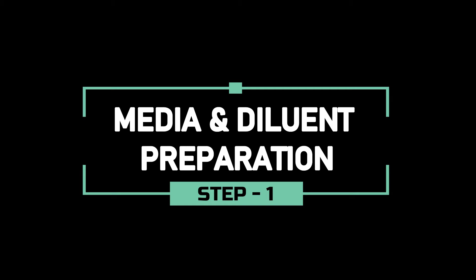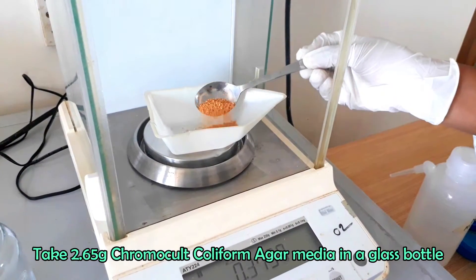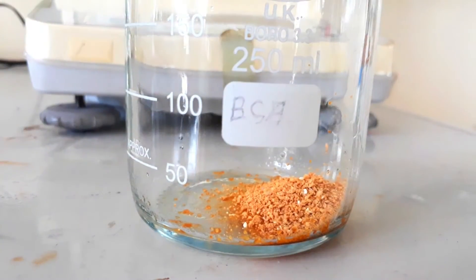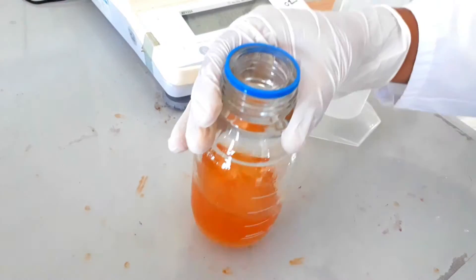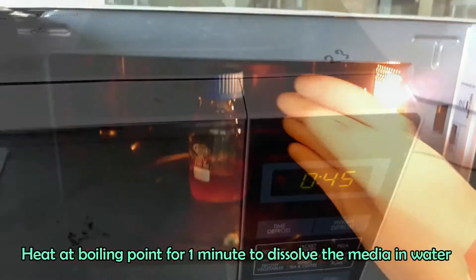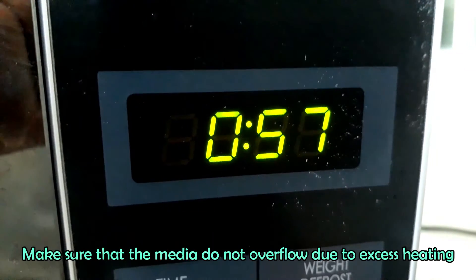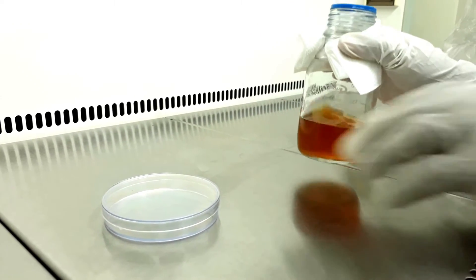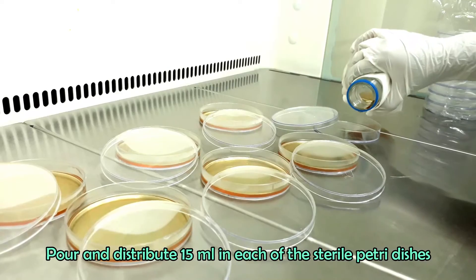Before going for the main test, just take a look at the media and diluent preparation. To prepare chromocult coliform agar, dissolve 2.65 grams of dehydrated agar media in 100 ml distilled water. Boil the media at 100 degrees Celsius in microwave oven or hot plate. Rotate the flask to mix the content. Apply heat if required but do not overheat. Pour 15 ml into sterile petri dishes and allow the plates to cool and solidify.